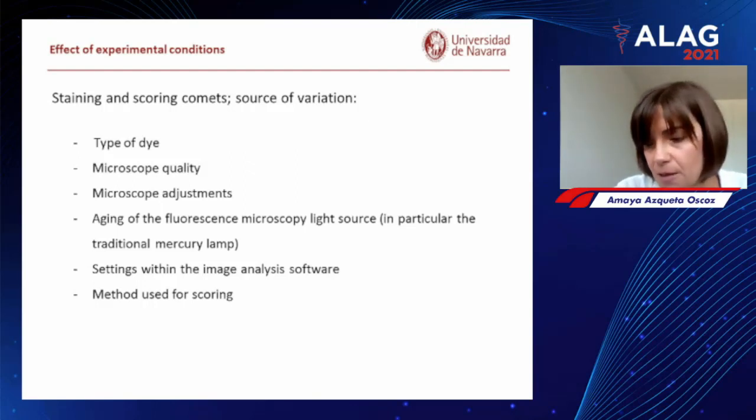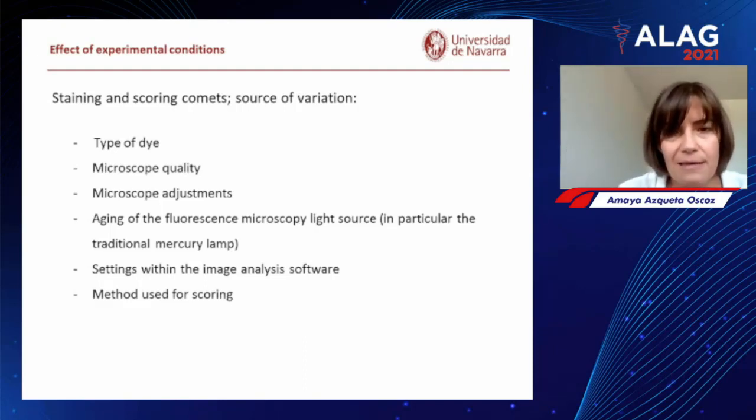Actually, we experienced in my lab a couple of years ago that we were obtaining very strange results, and then we realized that the lamp was quite old. So we made some tests and we realized that we were having a lot of variability because of that. So we started with an LED lamp, and now everything seems okay. Also, the settings of the image analysis software can affect the results, and of course the method used for scoring.